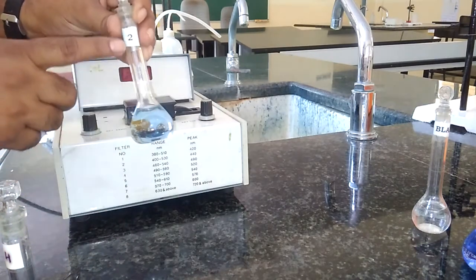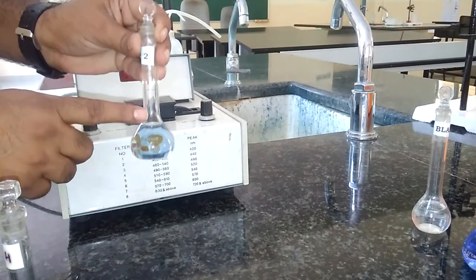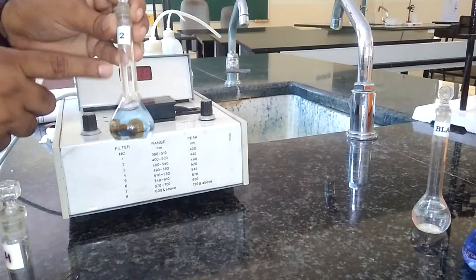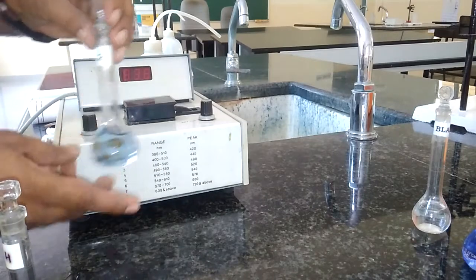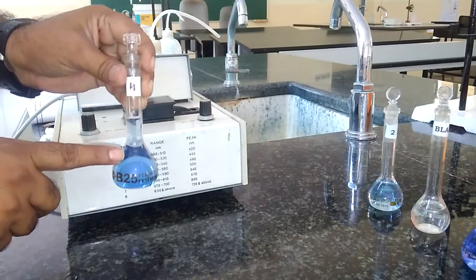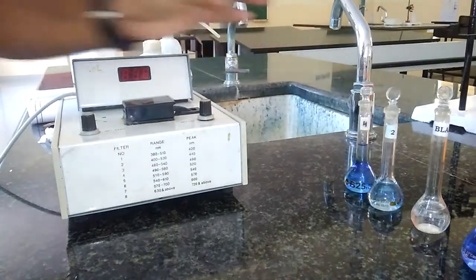The 2 ml standard is prepared by adding 2 ml of copper sulfate, then 2.5 ml of ammonia which acts as a coloring agent or complexing agent, then adding distilled water up to the 25 ml mark. Similarly, the 4 ml standard is prepared with 4 ml of copper sulfate, 2.5 ml of ammonia, and distilled water made up to the mark.